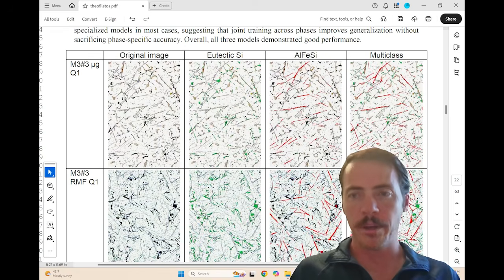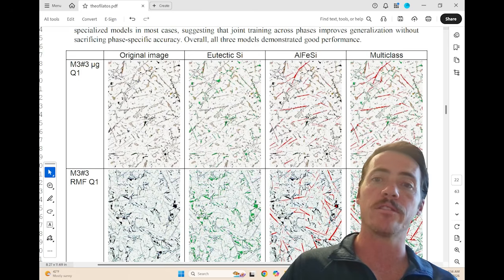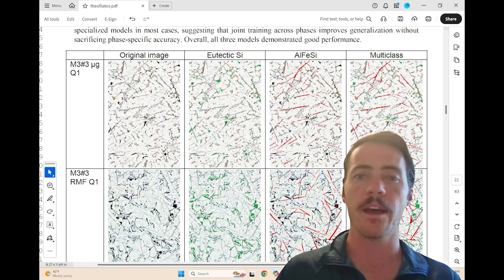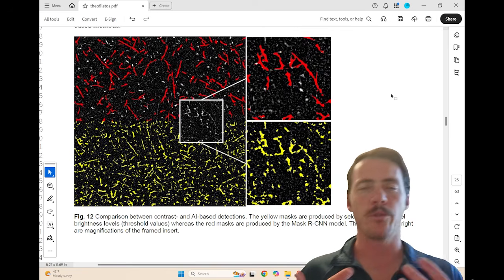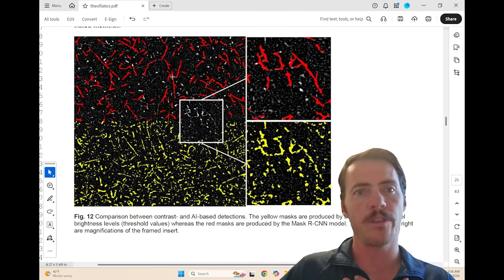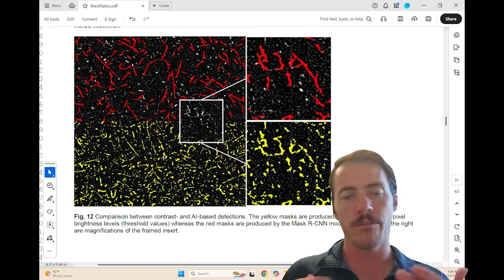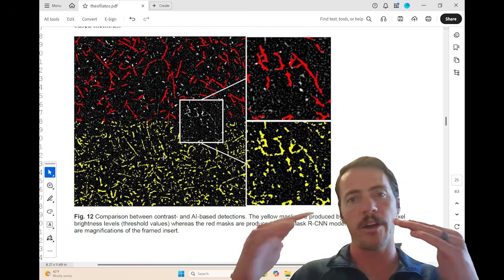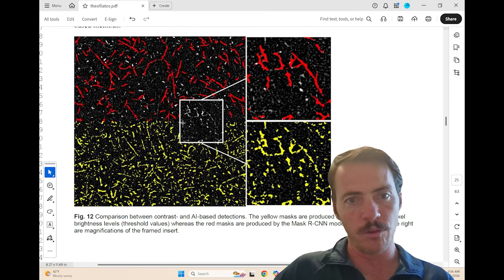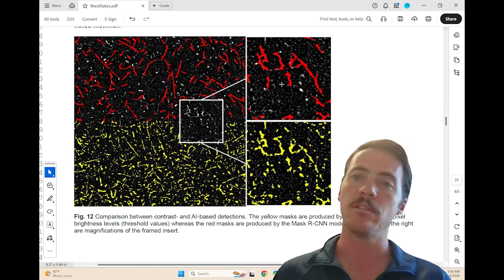And while obviously these pretty pictures sort of look nice, you actually want to assess it against actual metrics. And they show that this actually does a better job than other segmentation techniques when you consider precision and recall of these different classes that it's being asked to segment. And again, had you done this with one of the traditional approaches, say like thresholding, you can really see the difference here. So they've done half the image in red here with the new approach. This is the Mask RCNN model. And the other half in yellow here is just based off of thresholding, right? Where you basically say any pixel over a certain value gets bucketed in one class versus another. And you can see how, in the zoomed in white box here, it's doing a much better job with this Mask RCNN. So this is actually an effective tool for segmentation.